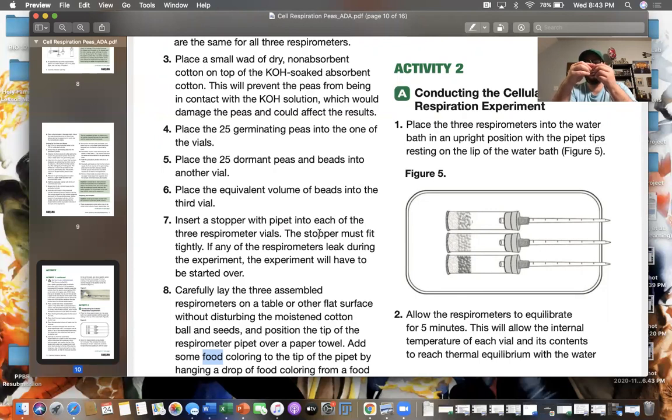Got a little rippage, that's okay. If your parafilm rips like mine just did, don't worry about it. Just stretch it out, keep going over and wrapping. Because we don't want to notice that these are leaking when we're actually running the experiment.